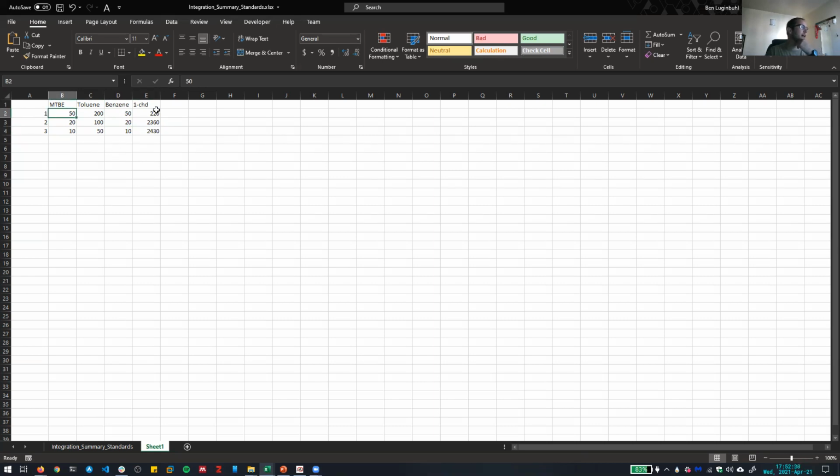So if we want to figure out the molarities of each of these things that are in these solutions, how can we go about doing that? What should we do? What other data do we need? Thinking back to Gen Chem stuff. Anyone remember how to go from just a volume of something to a molarity?